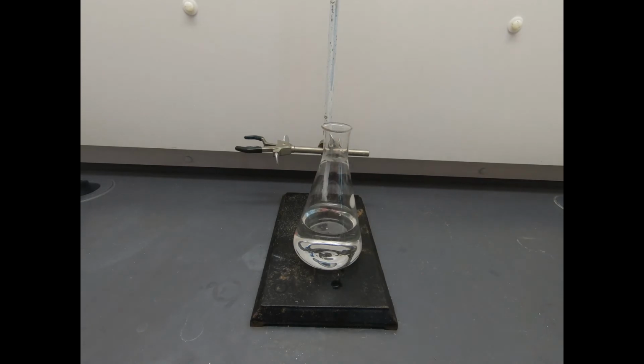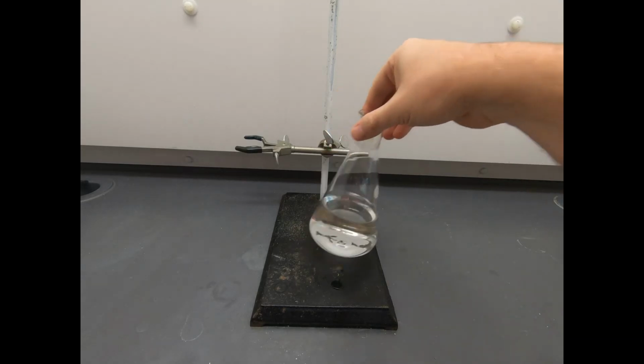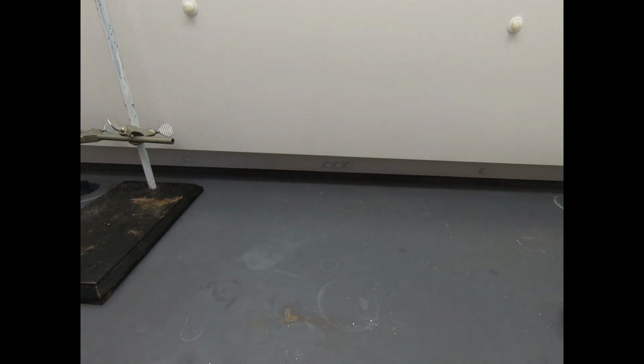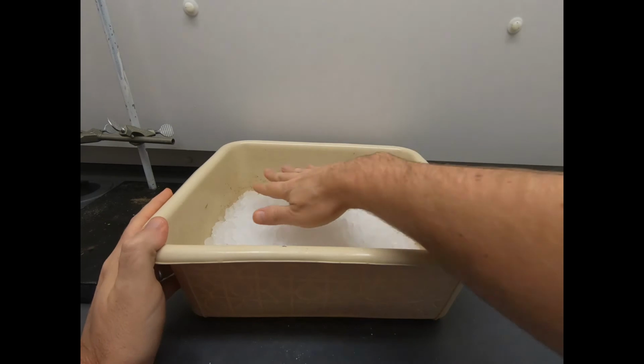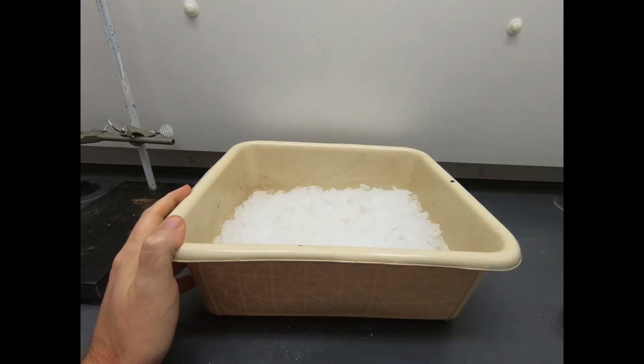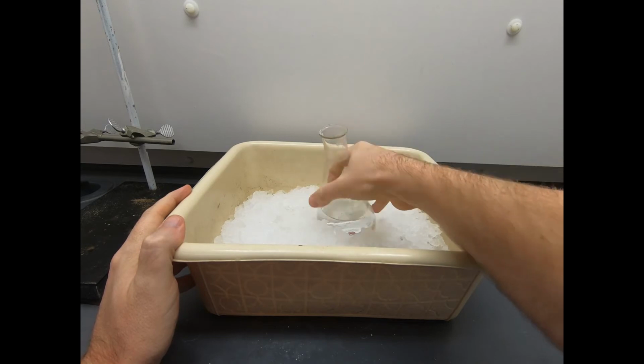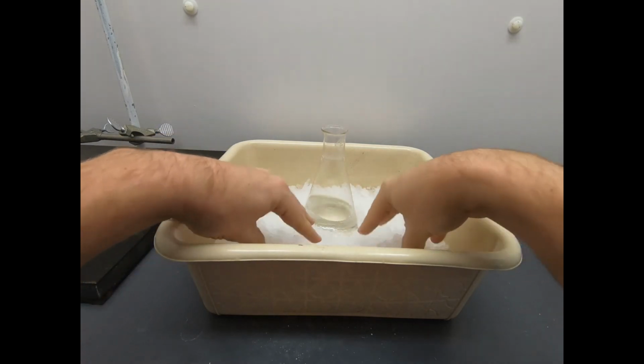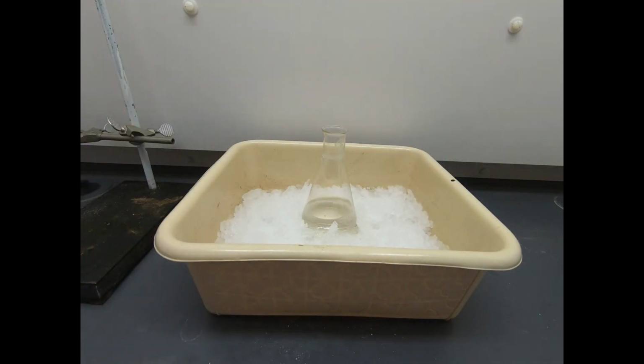Okay, so what we're going to do is put this on ice, and that will help our cause of getting our material to precipitate. So let's put this to the side. Let's get this ring stand out of the way. And here is just the classic lab tub of ice. And let's stick our flask in here. Great. Nice and cool. Okay, we'll leave that on ice for a little while, and hopefully we will see some precipitation occurring, and we'll get a nice yield, or at least a reasonable yield, of our aspirin recovered from these tablets.